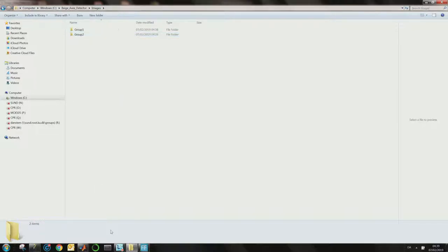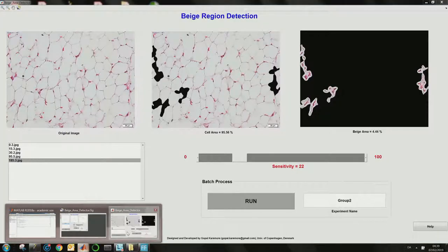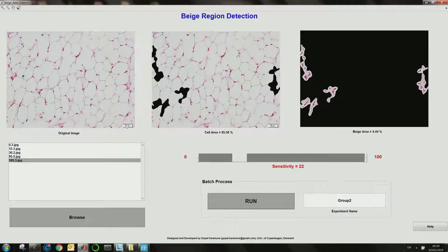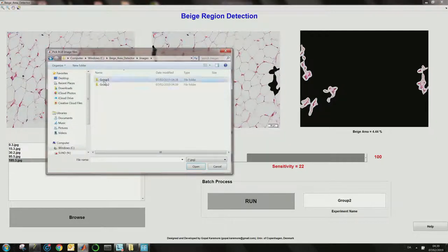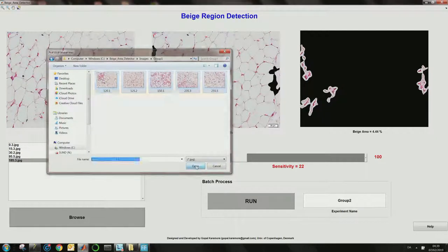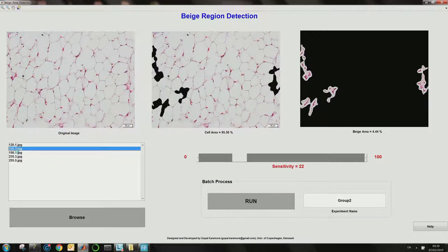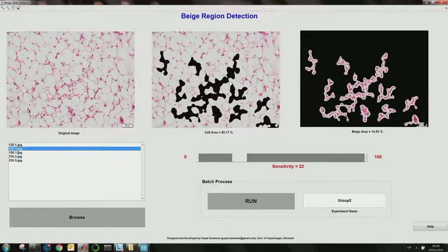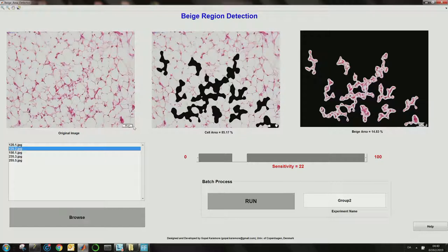There is also one issue to be aware of: if an image contains an annotation such as a scale bar, this will affect the beige area calculation. Going back to the images of group one and importing them, you can see that because of this annotation artifact from the scale bar, the beige area calculation is affected.